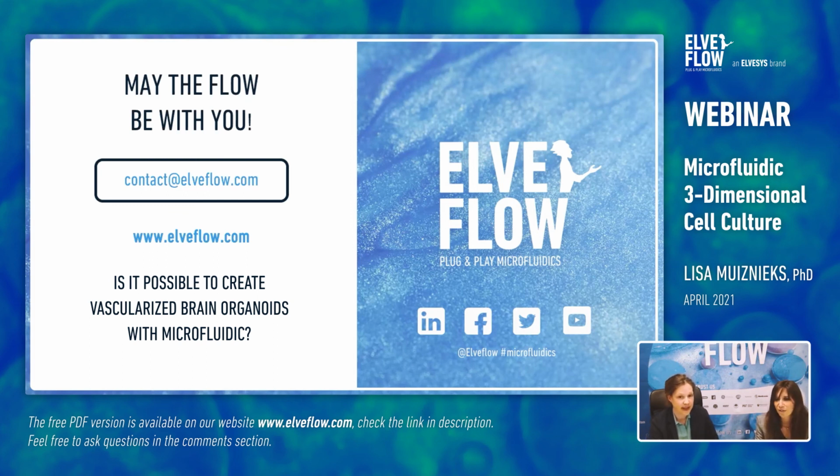Yeah, in general, I would say as a general comment that when you get your chip, as soon as you have your specific cells that you want to grow into it, then you can definitely recreate any kind of organ, let's say, and applying then a flow to mimic all the dynamics and interstitial flows or mimic endothelial cells and vascularization then accordingly.